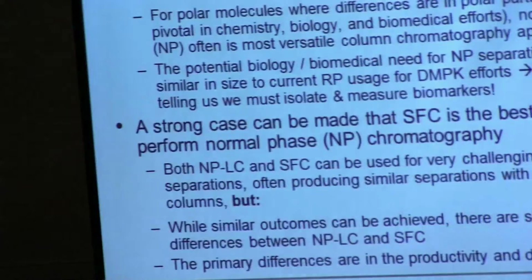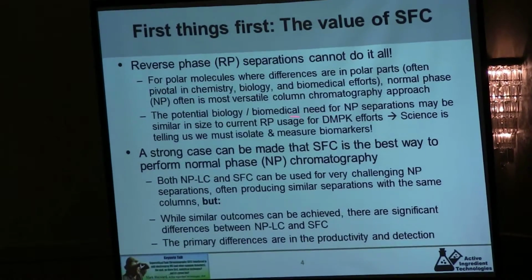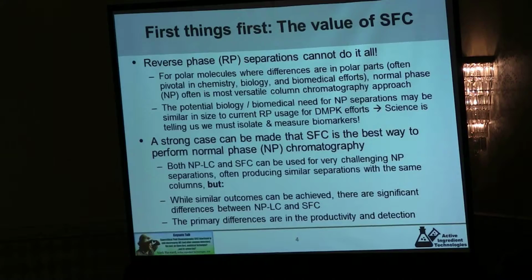So you want to get at those polar parts. You could do that in the traditional way with hexane kind of column solvents, but there appears to be a much better way to do it, and that is with supercritical fluid chromatography. So just think of supercritical fluid chromatography as the same as you would normally do with hexane, except you have substituted CO2 for the hexane. So whether it's with the traditional approach or by SFC, you can do very, very challenging separations and get very similar outcomes with either approach.